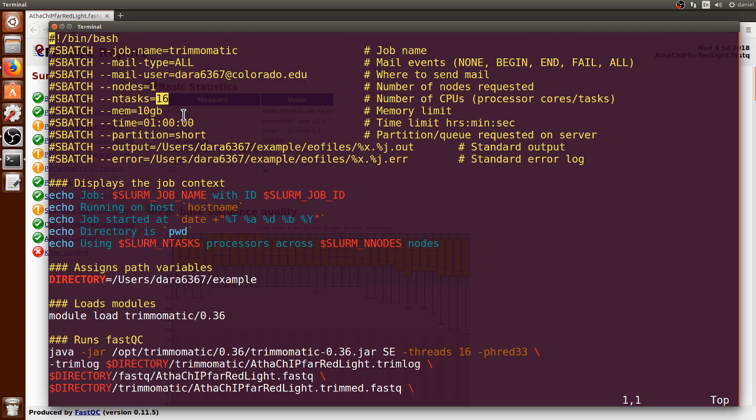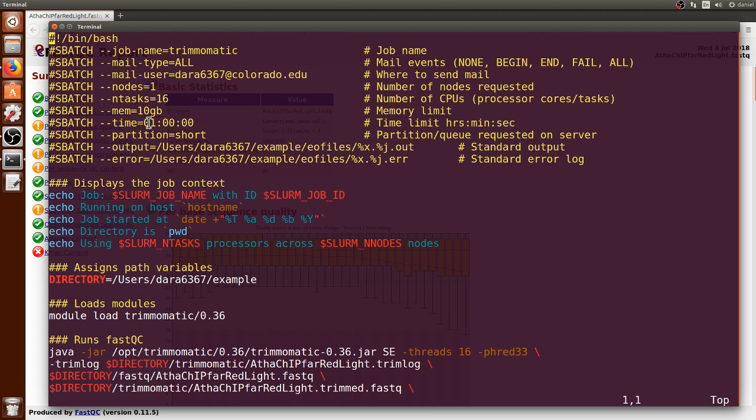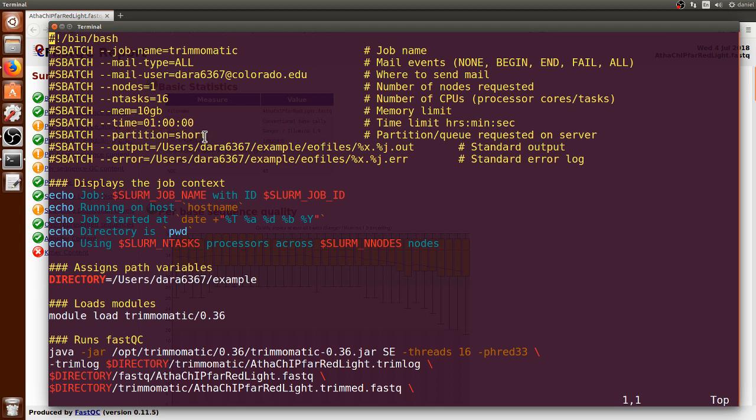I am using one node and 16 processors, because Trimmomatic can use multiple processors to accelerate the processing. 10 gigabytes of memory and one hour. That will be enough. The queue will be the short queue.